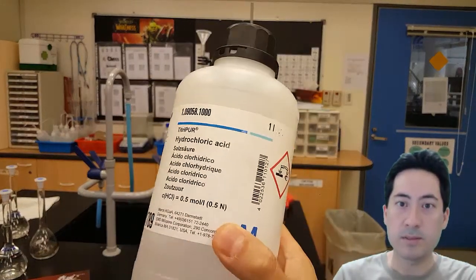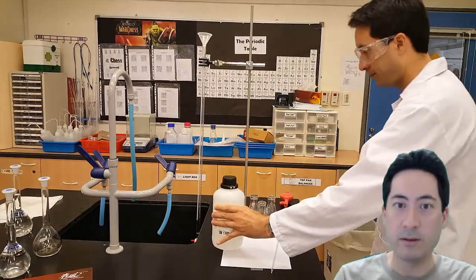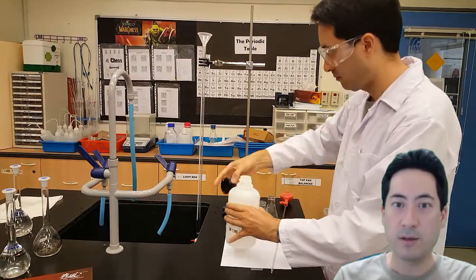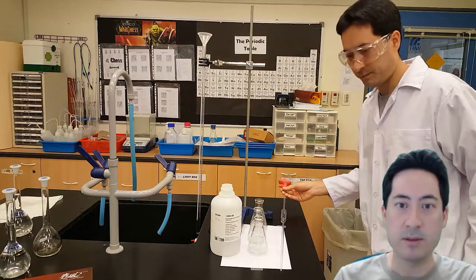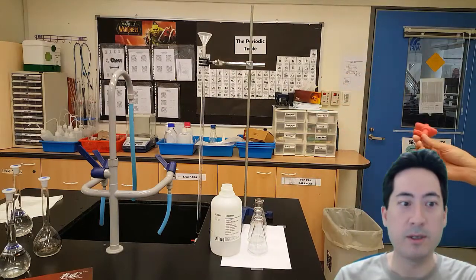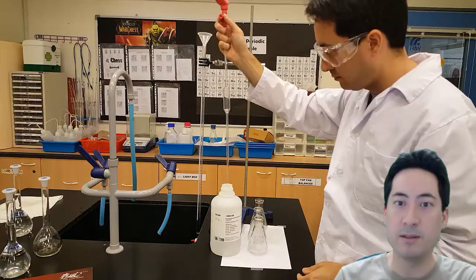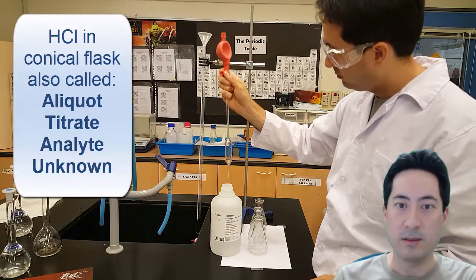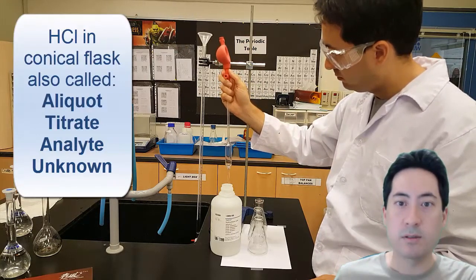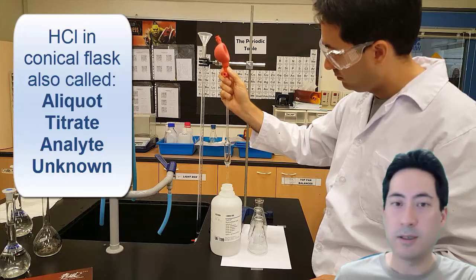So this is the substance that we're going to pretend is the unknown, it's the hydrochloric acid. We're going to pretend that even though it's 0.5 molar, we don't know what the concentration is. And so we have to pull out aliquots of this substance. This is also called the analyte or the titrate.